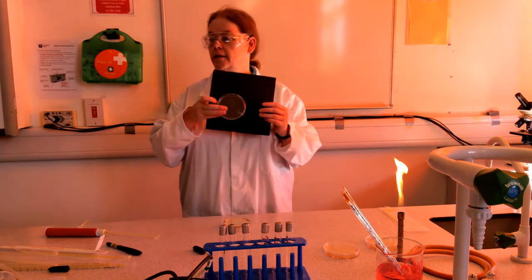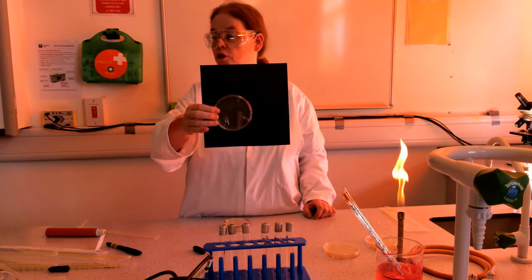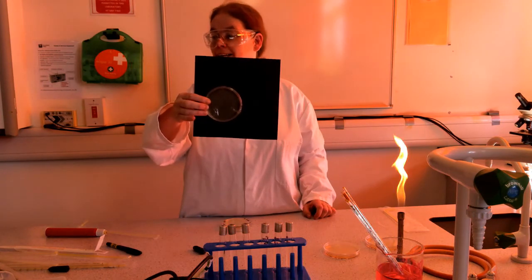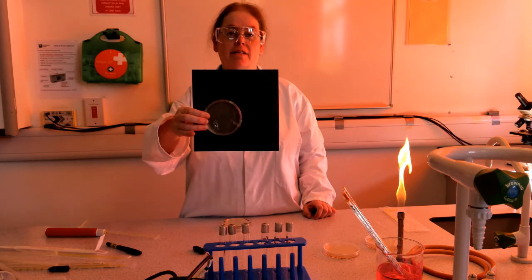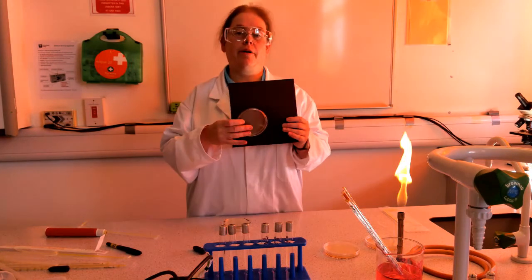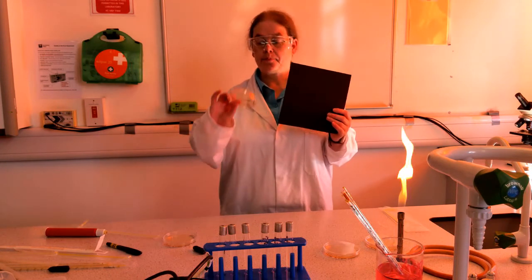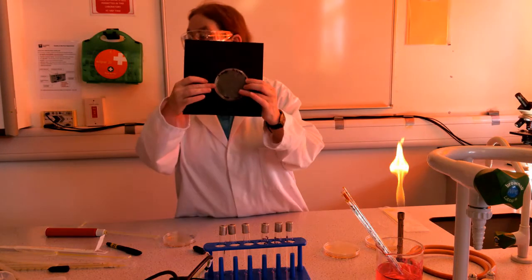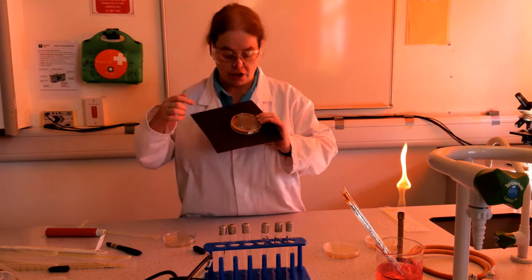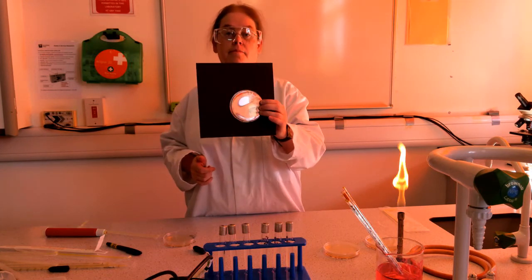So, still doesn't show brilliantly. This is my million dilution, and as I hope you can see, there's nothing growing on it. So obviously there wasn't even one bacterium in my million dilution that I prepared earlier this week. The 10,000 though, and again I'm afraid it's quite difficult to see, but if you have a good imagination, it's speckled with hundreds of tiny colonies.